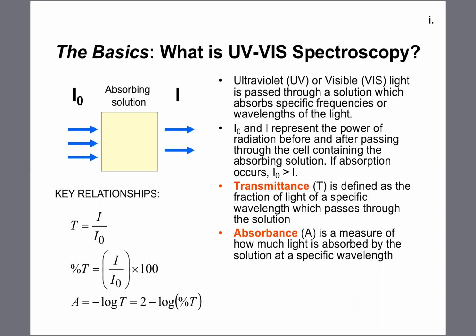But another thing that we can do with these types of measurements is actually quantify the amount of material present. So to do that, we need to define a few terms and understand them, and then figure out how we're going to use them. So something called Beer's law.